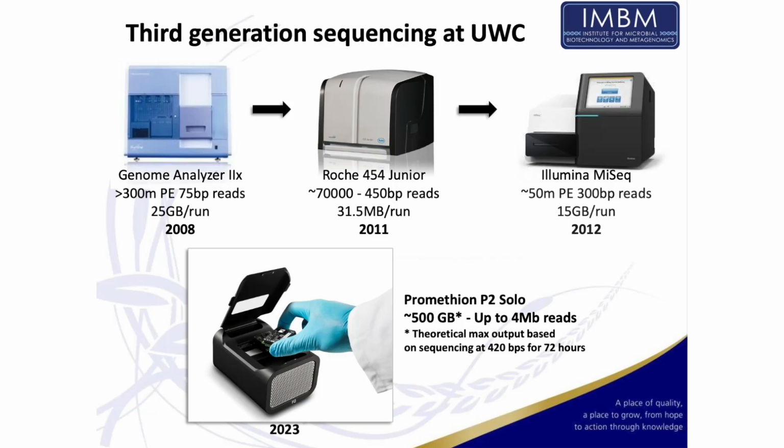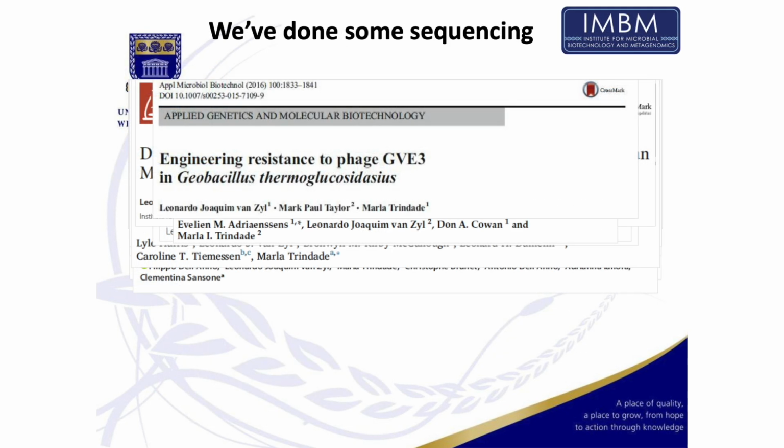And that MiSeq machine, this is just to brag a little bit. So these are the different publications that have stemmed from our sequencing. So we've certainly put that machine to good use. So that was also bought with taxpayer money. We are very aware that we all contribute to this pool of money, and we try and impart that to the students, that these things should count.